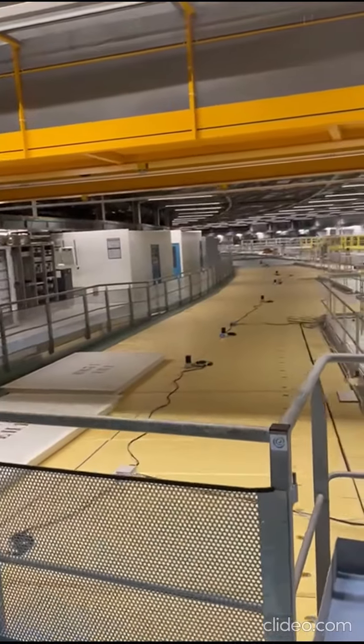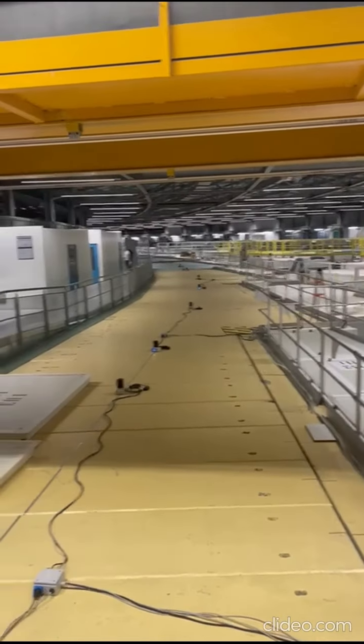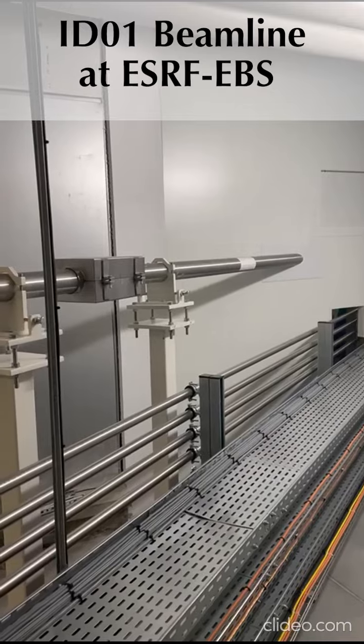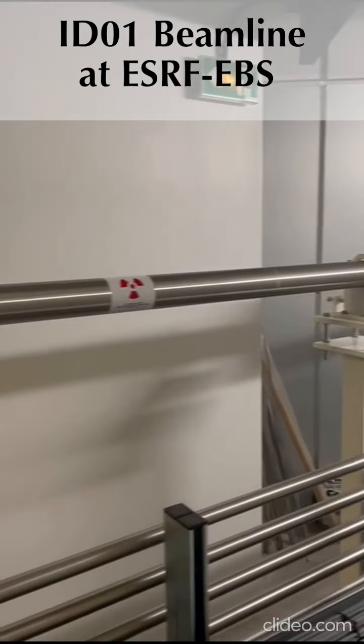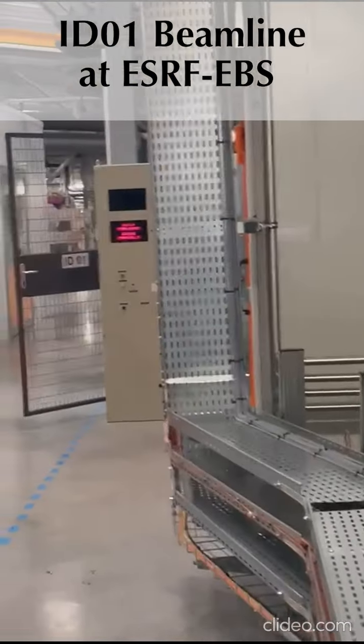Here, as you can see, I am on top of the synchrotron, and this is the chamber under which the electrons are accelerated using the system of magnetic fields. There are different beam lines that come out of the synchrotron, and this is the ID01 beam line.